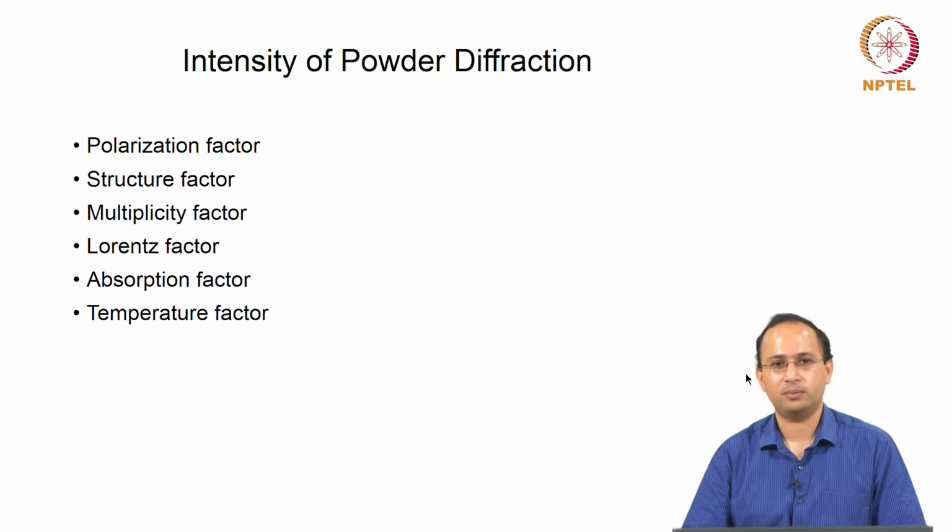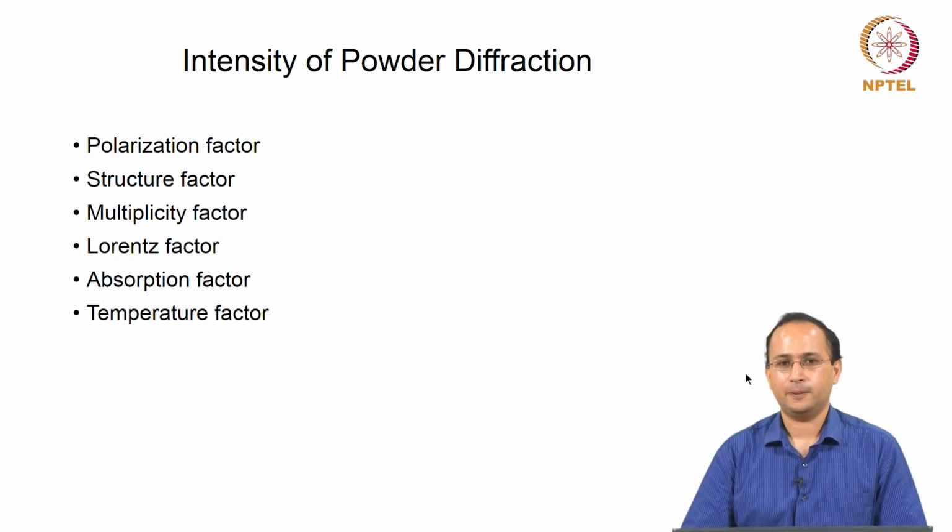We talked about Bragg's condition, which gives you diffraction. You can think of it as constructive interference. There is a condition which has to be met, and if it is satisfied, you get diffraction. So now we know that you get diffraction from a crystal, and the dependence on the plane and the incident angle is dictated by that relationship we talked about.